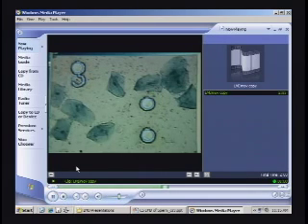How many sperm cells do you think you need for a full profile? Well, we'll talk about that a lot tomorrow on the research. If you use standard PCR conditions, like what's mostly validated in your forensic laboratories, I'd say 100 cells is really the bare minimum. But I did a lot of work on low copy number work, so I went down to five cells successfully to get profiles. We'll talk a great deal tomorrow about that.